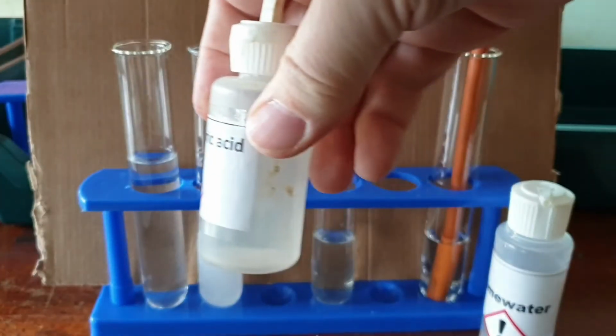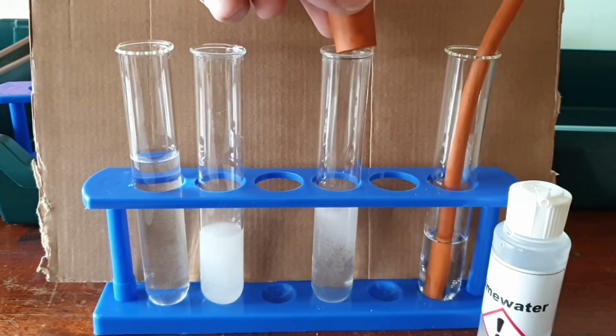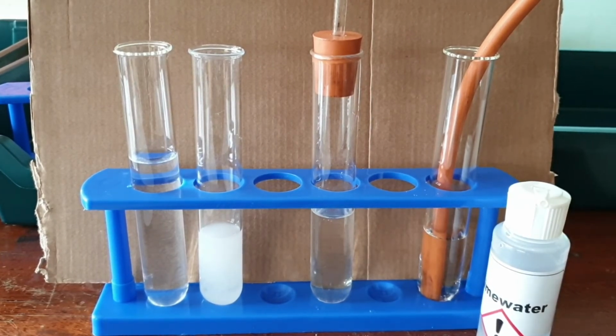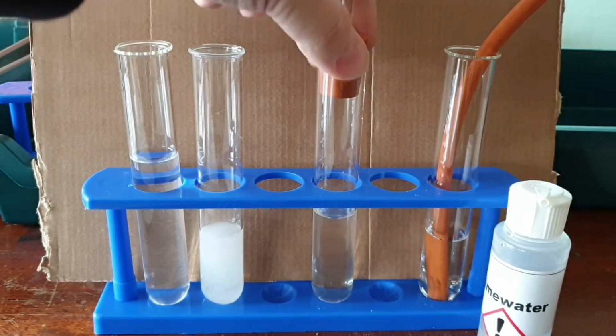So I've got some hydrochloric acid here, so I'll chuck in the hydrochloric acid, put the test tube on the top, put the bung on the top, and then hopefully, although I might have missed it, might not have added enough. We should be getting some bubbles through there.